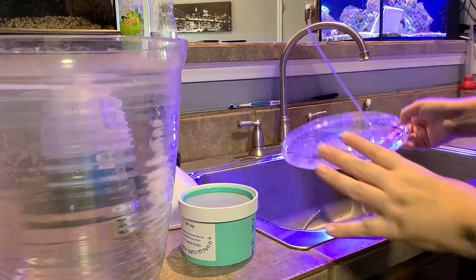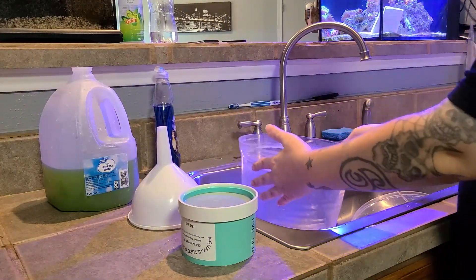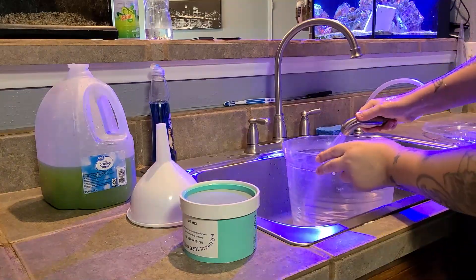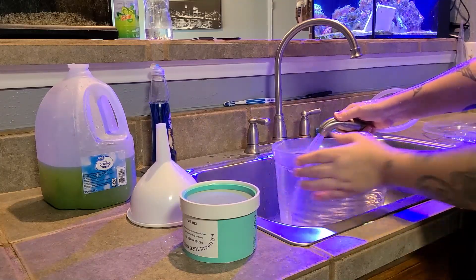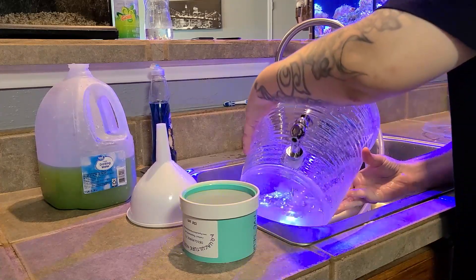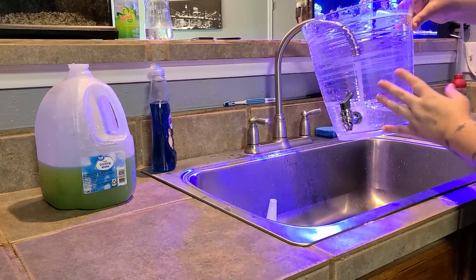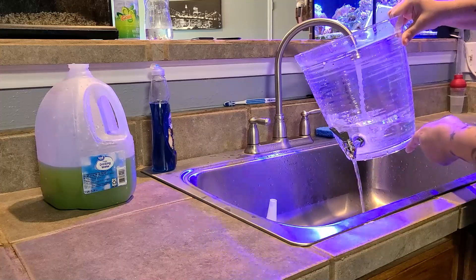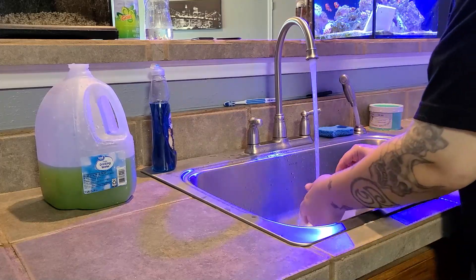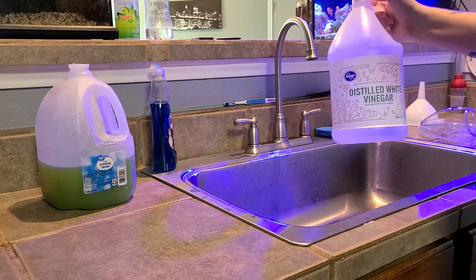Next up, I'm going to go ahead and rinse everything with some hot water — just regular tap water — and then take some vinegar and rinse everything out once again to sanitize the culturing container. If you're culturing in a container like mine that has a spigot, don't forget to run the hot water through there as well as the vinegar.